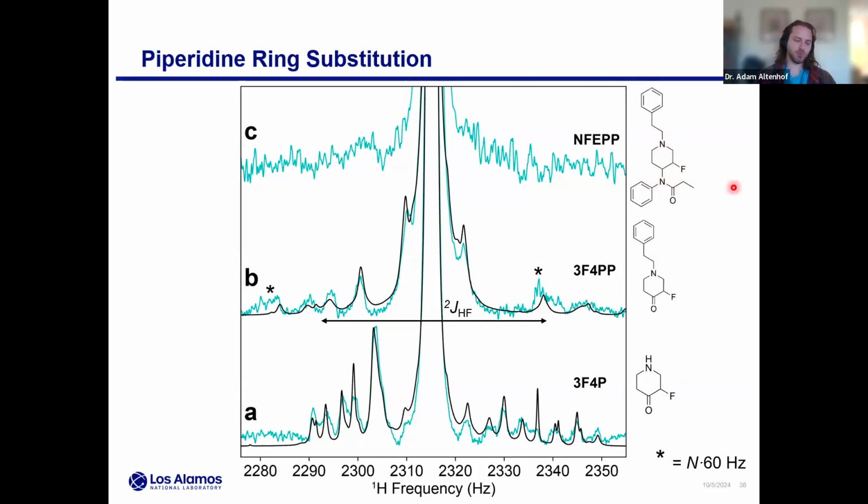So, 1 nitrogen being present causes significant line broadening and SNR reduction. 2 of them is even worse, plus the many-spin complexity. So it's interesting and shows pretty clear limitations of how far the spectroscopy could go.